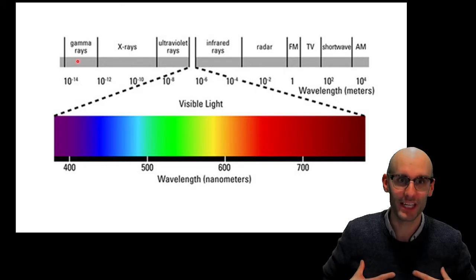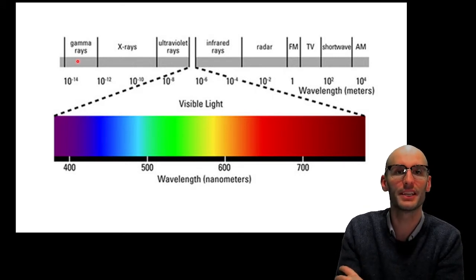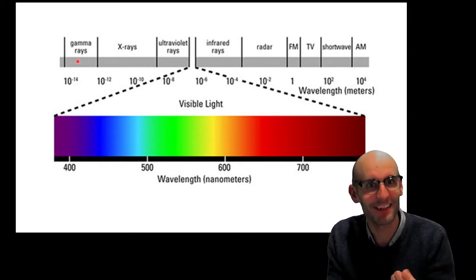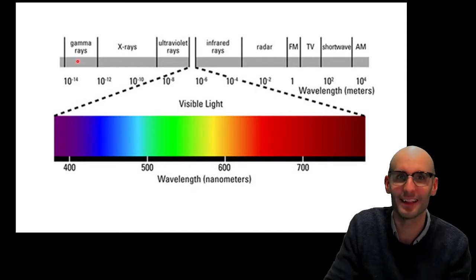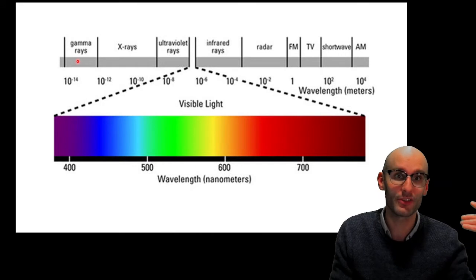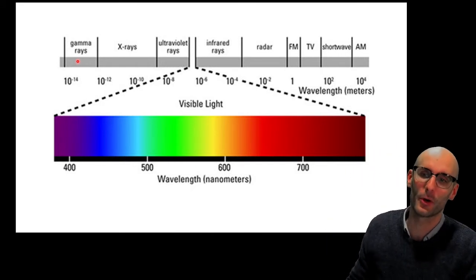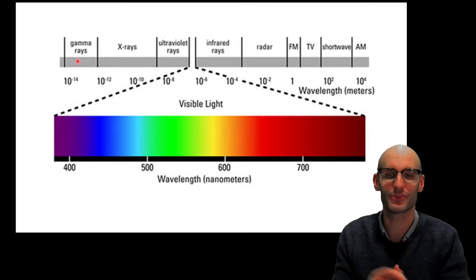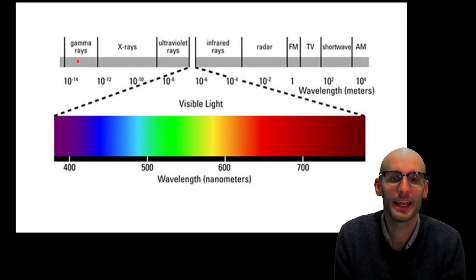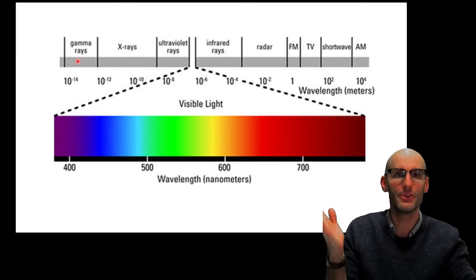That's why we use X-rays to look through our body. It so weakly interacts with tissue that it travels straight through our muscle. How are we supposed to see a cell if it doesn't interact with the cell? It's just going to go straight through the cell that we're trying to see under the microscope. Gamma rays go straight through us, and they even go through a good chunk of lead before they are stopped. So it's because they're weakly interacting. So basically, when we want to look at something incredibly tiny, the electromagnetic spectrum isn't the right thing to use. So what should we use then?